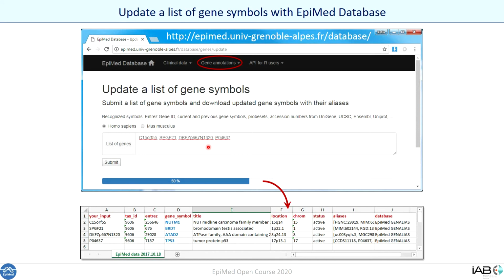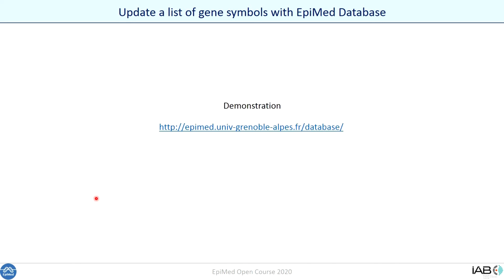You don't need to create queries in code. This application will query different databases behind your initial query. And you obtain the result in the format of an Excel file or CSV file, so in a structured format that you can then process with your code, or use if you want to create graphs and so on. So it's rather easy and user-friendly finally.